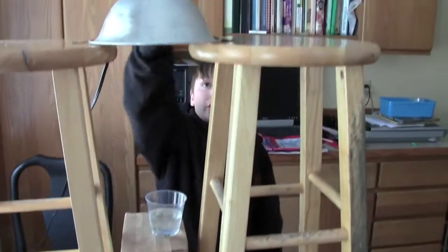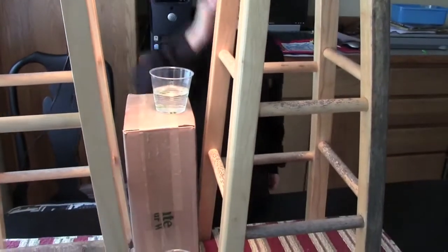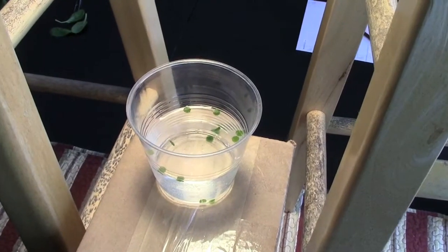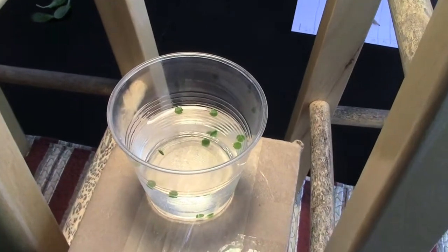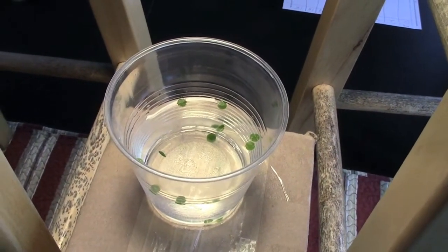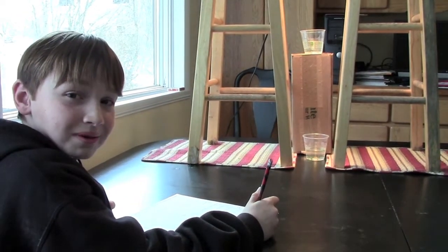And turn on a light. We're testing light intensity here. When leaf discs start to photosynthesize, they'll fill up with oxygen and start to float. We record the number of leaf discs floating every two minutes.